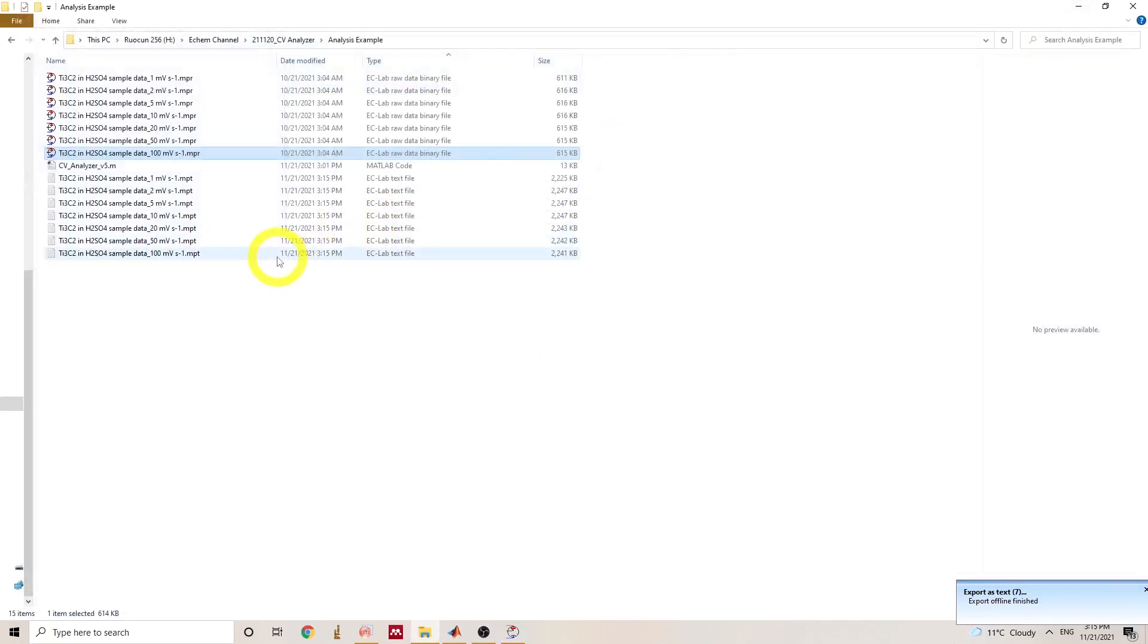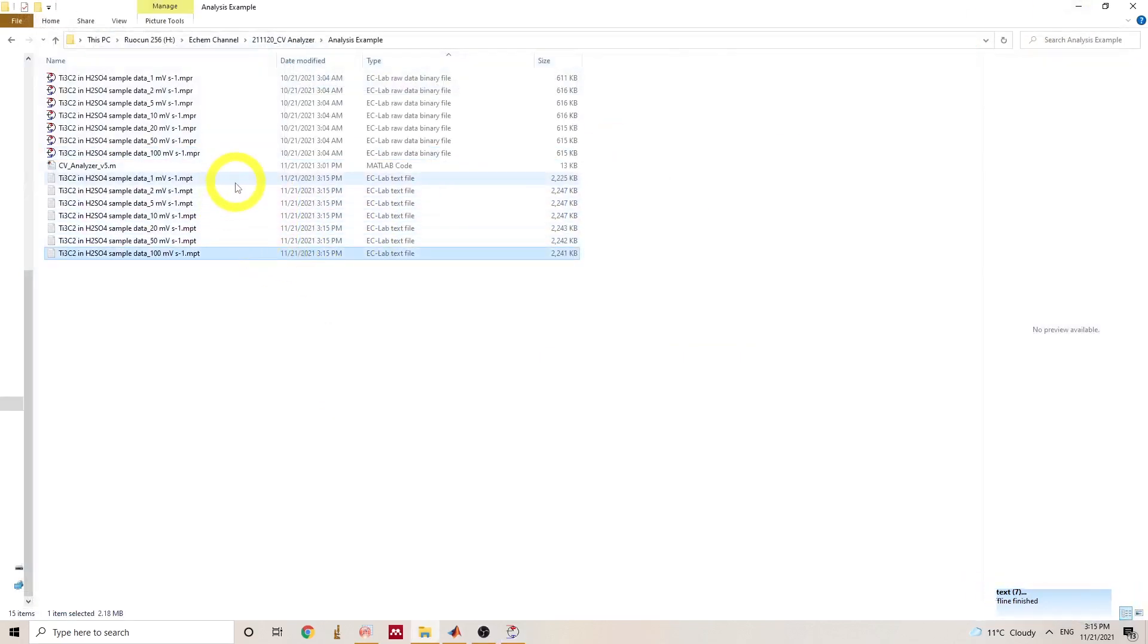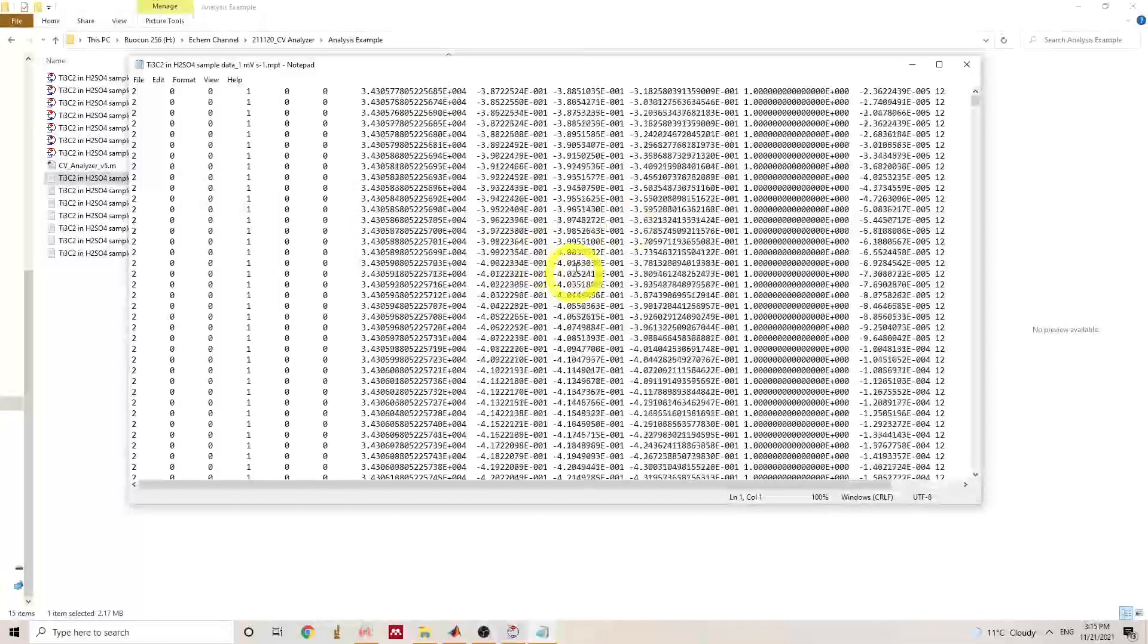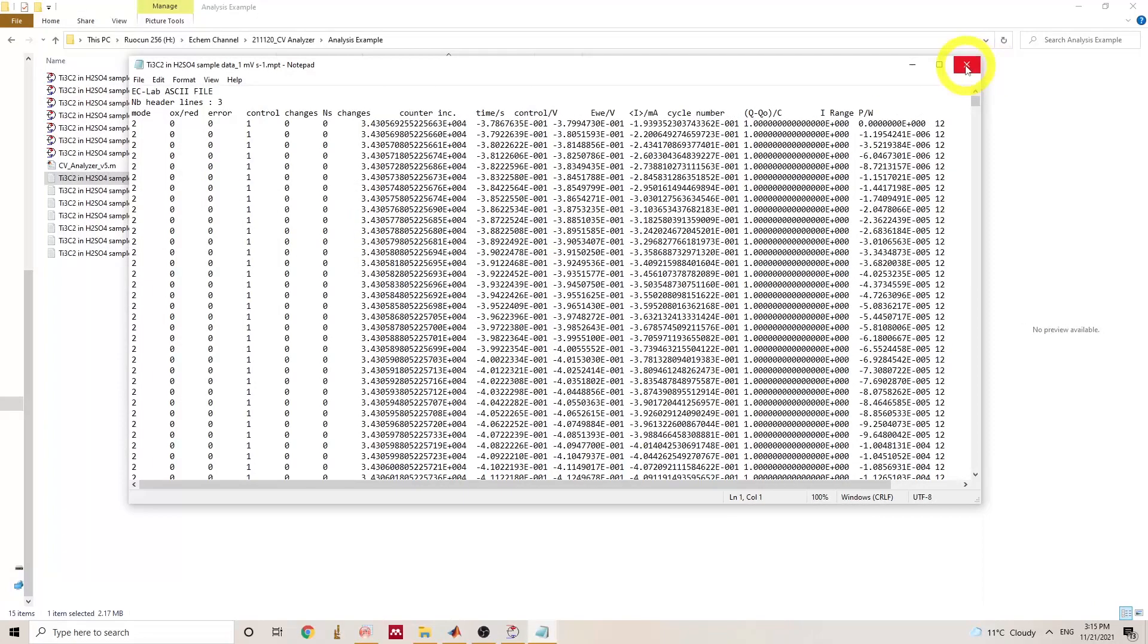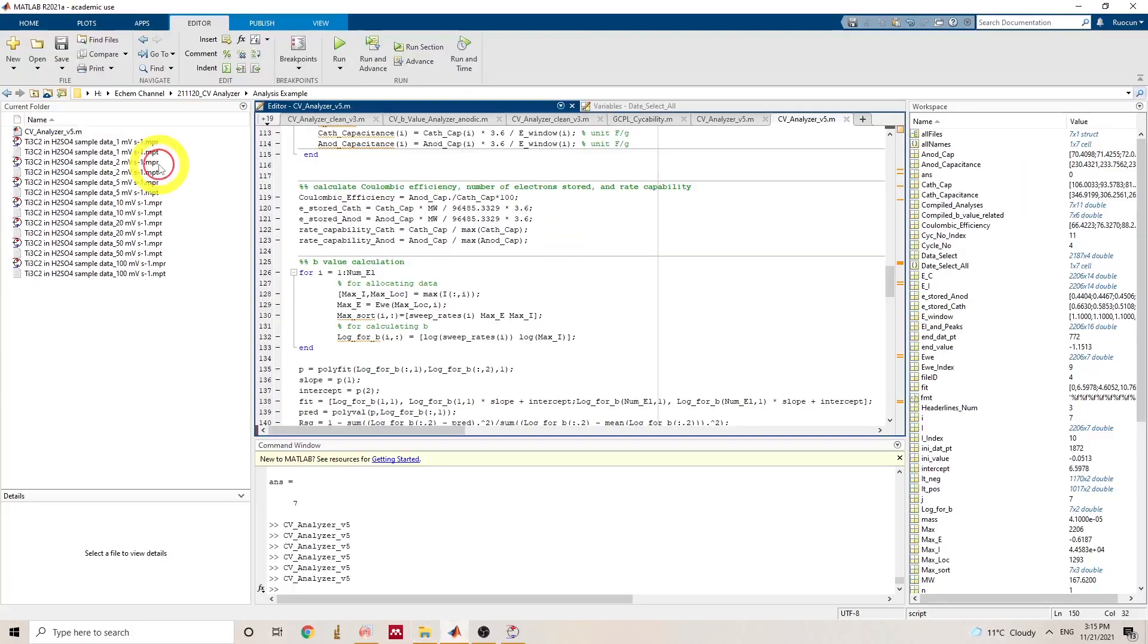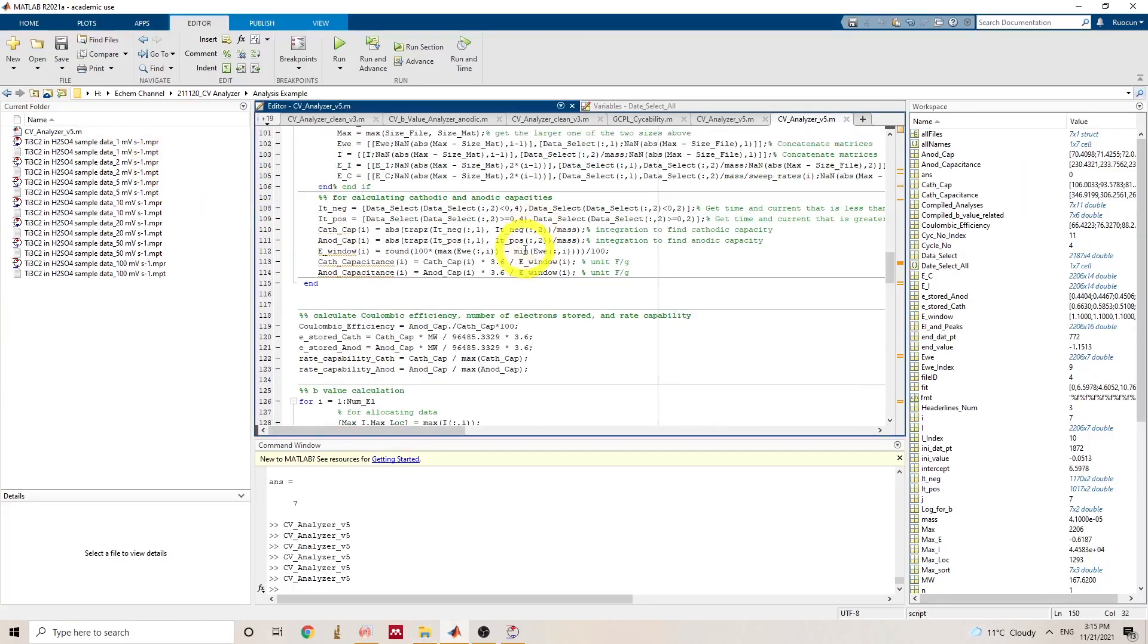And as you can see, the files are generated in the format of MPT. So these are the data files. And to perform the analysis, we'll just double click here.